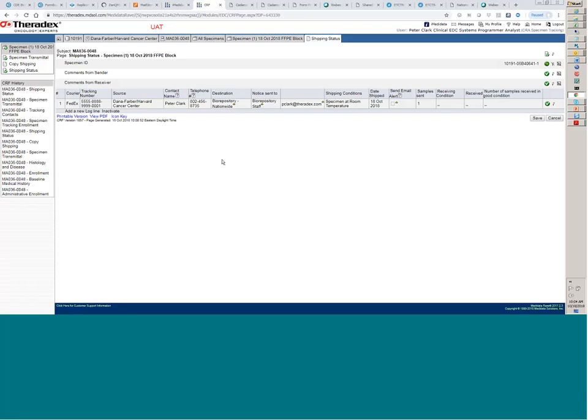Great. And then the second piece I just wanted to confirm is that, obviously, the pathology reports aren't going to be available at the time that the specimens are sent. So as long as the record remains open so that it can be added later when it becomes available, I just want to make sure that shipping the specimens doesn't somehow close the record, so that people can come in a week later and upload the pathology report when it's available.